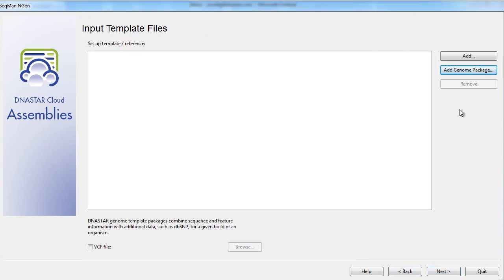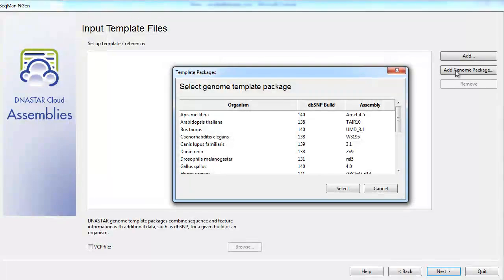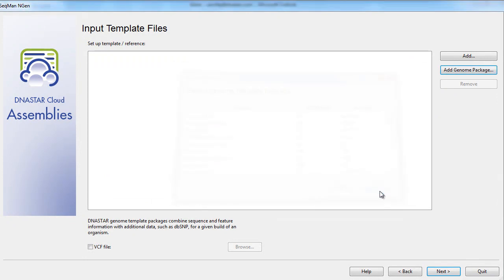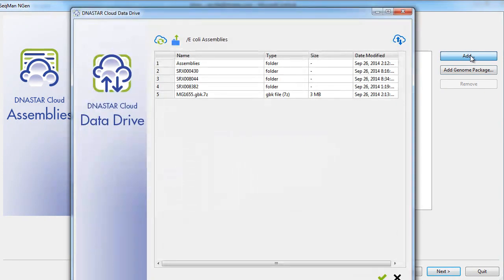As we're running a templated assembly for this example, now we'll add in our reference file. If you're working with model organisms, we do have multiple DNA star genome template packages built into the program. However, we'll add in an E. coli reference file that I've added to the DNA star data drive.